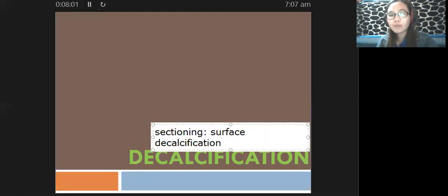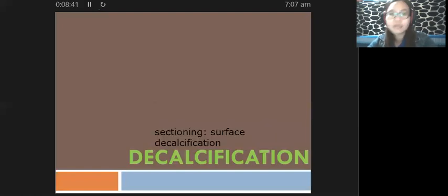Okay, so that means there are actually two instances wherein we can perform the process of decalcification. Number one, after fixation, and number two, during sectioning. So you can perform decalcification also if, for example, that was the only instance when you were able to detect the presence of your mineral deposits or your calcium deposits. Okay?